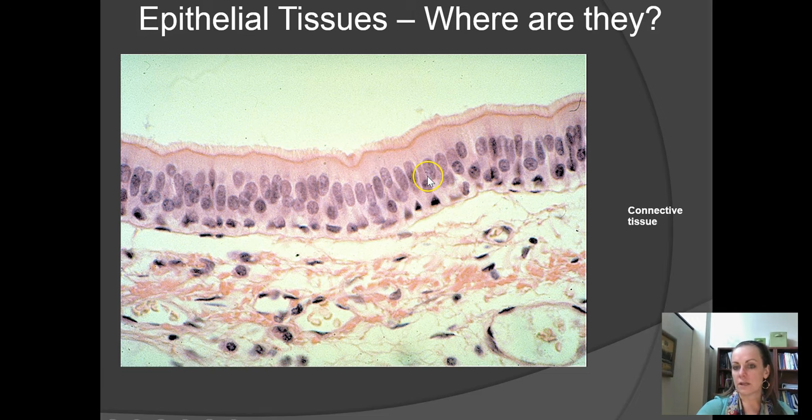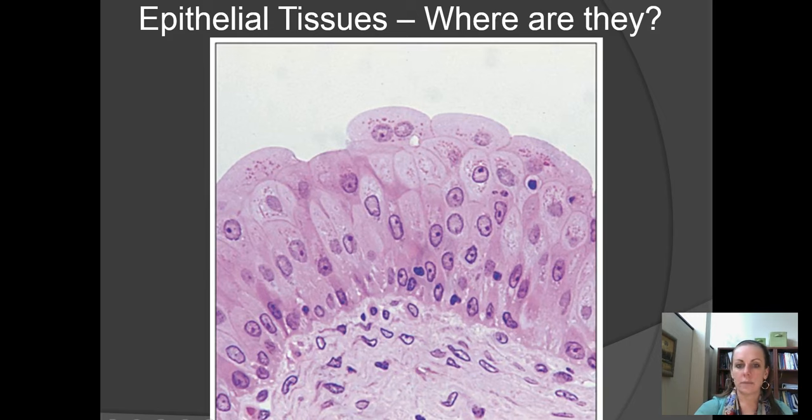You can clearly see each of these circles, and you notice that up here at the top, these purple circles, okay, they're pretty close together. But as we go farther down into this tissue, we still see purple circles, but you notice they're very spaced apart. And so it's actually the top here that is epithelial tissue, and here we transition into connective tissue. Okay, we can see that again here, white space on top. First we go into epithelial tissue. These circles are spaced pretty close together. So all of this is epithelial until you get right here. Now these nuclei are spaced far apart, and so we've moved into connective tissue again.